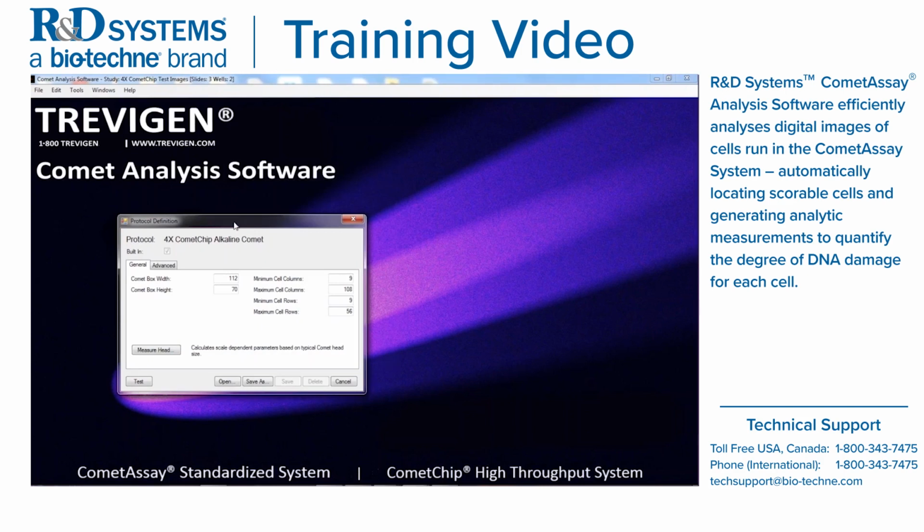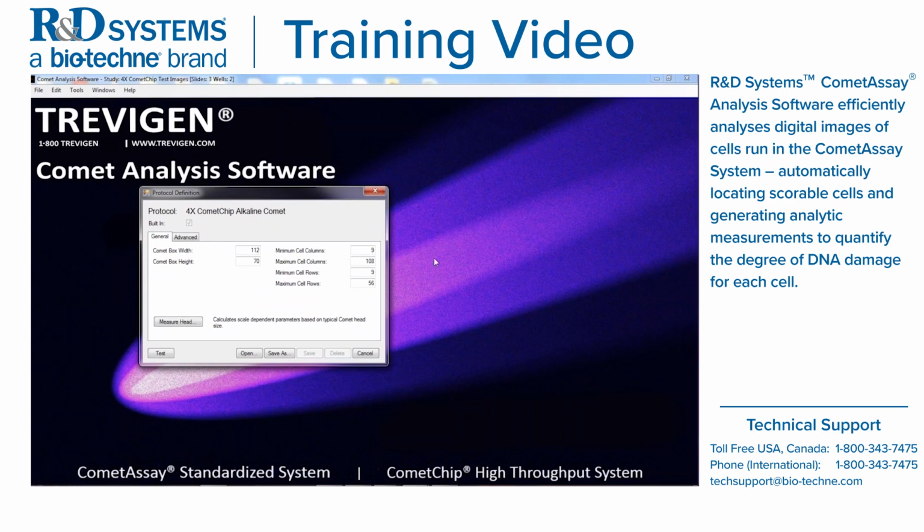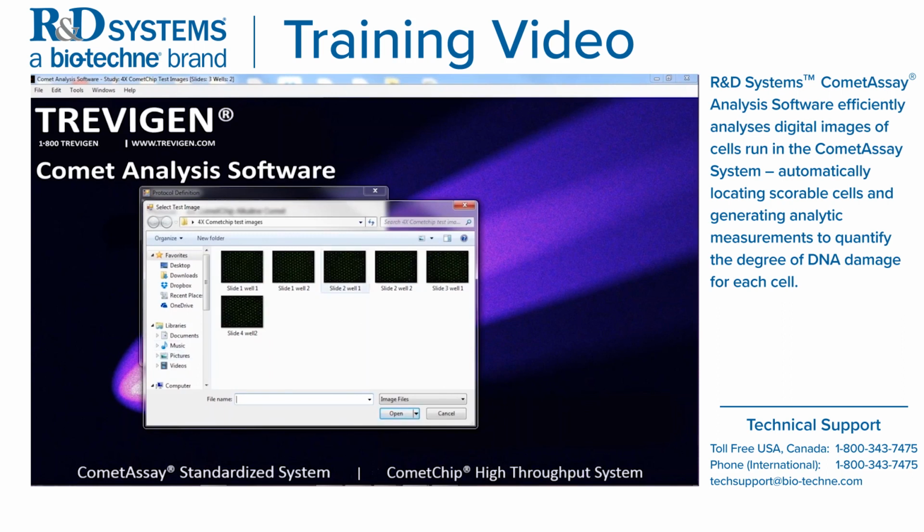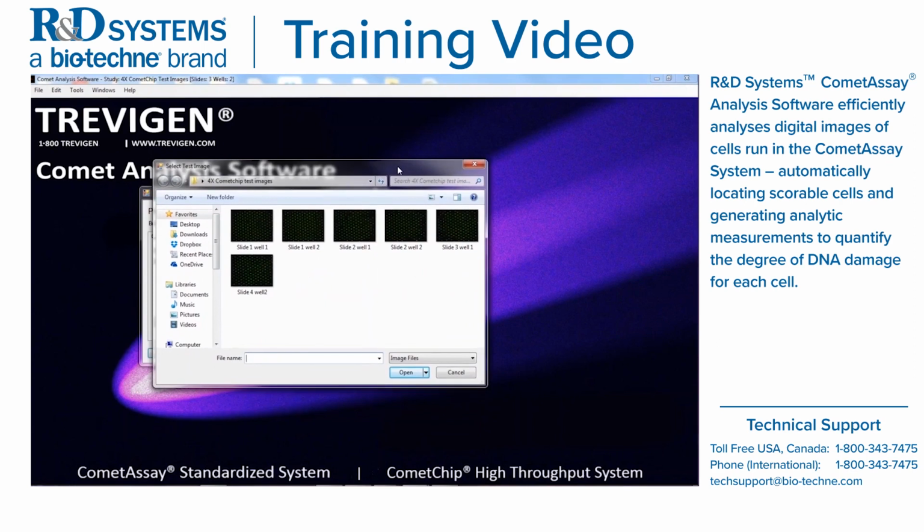Now this protocol definition window comes up, and the box width and height have already been set. So what we're going to do is test an image to see if this protocol definition works well with our image. So let's hit test. Okay. So when you're first testing an image, I recommend starting with an image that has some damage on it, because you want to make sure that tail is encompassed within that box. So again, you're simply using Explorer to call up these images. So let's open the file. And there you go. You just tested an image.